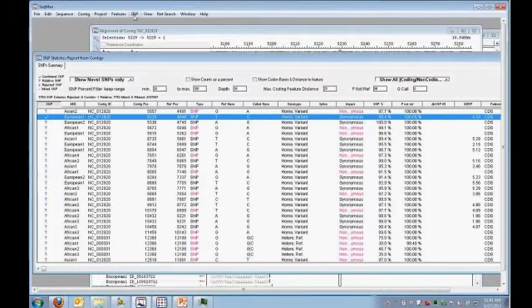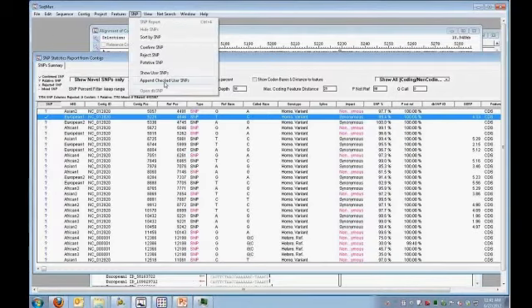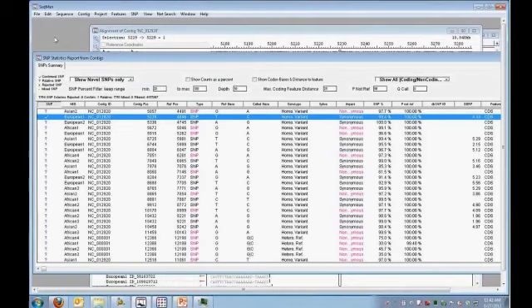And I can append my checked user SNPs. And when I click that, it'll just build to my dbSNP database. It'll create a little custom database. So it's a way to add SNPs to a little custom database file so that the next time I run data sets, I can then distinguish between SNPs and dbSNP, SNPs that I've verified on additional data sets that are novel and not in dbSNP yet.